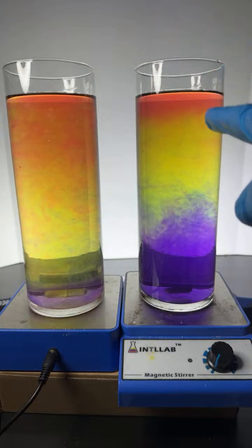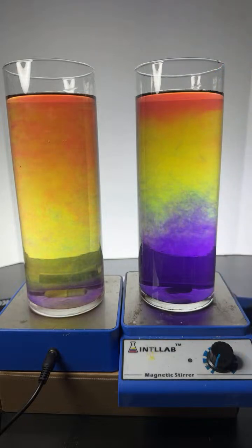We got a nice little pH gradient going here. The other theory, Kalura, are you meaning the other theory as an Arrhenius acid-base theory, or do you mean Lewis acid-base theory?